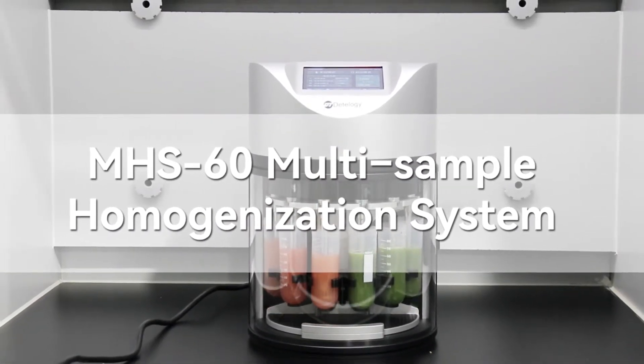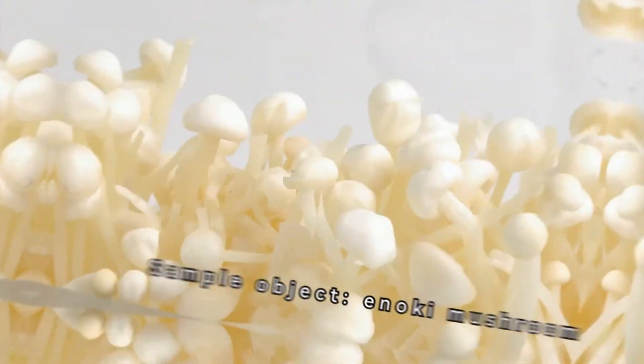MHS60 multi-sample homogenization system, a great assistant for food sample preparation.